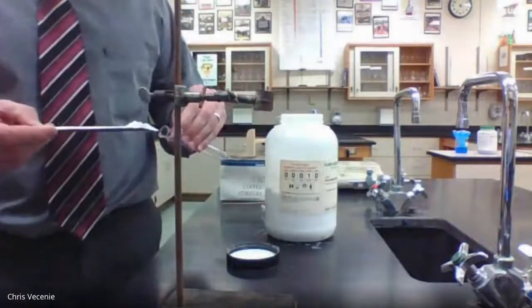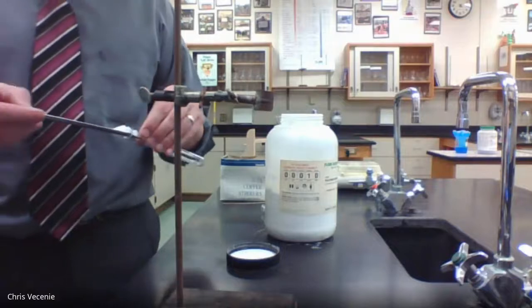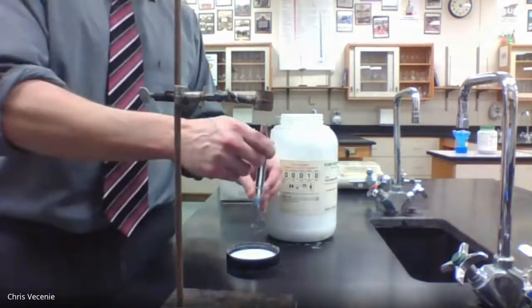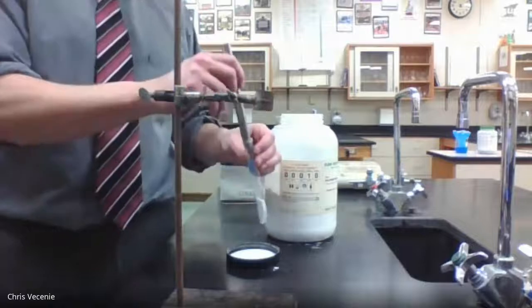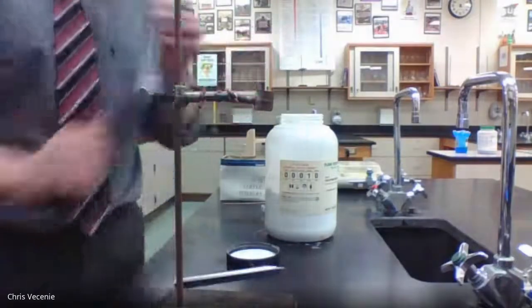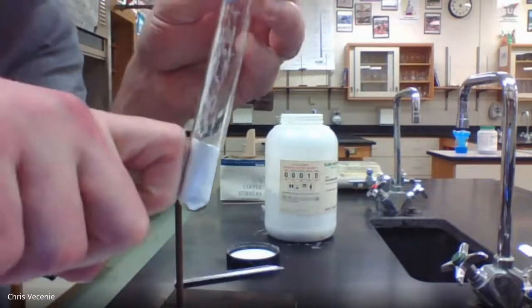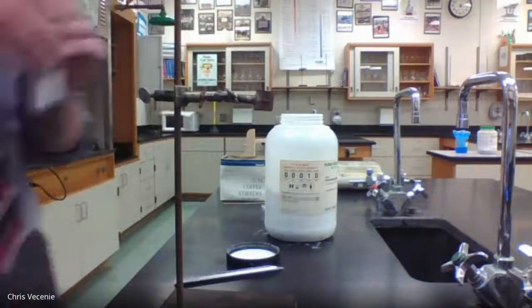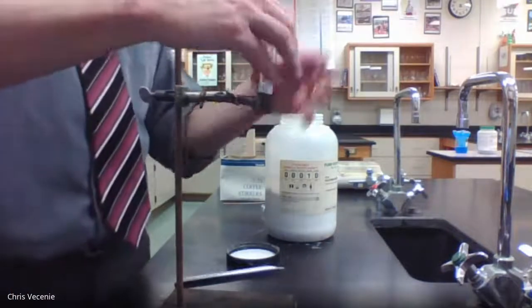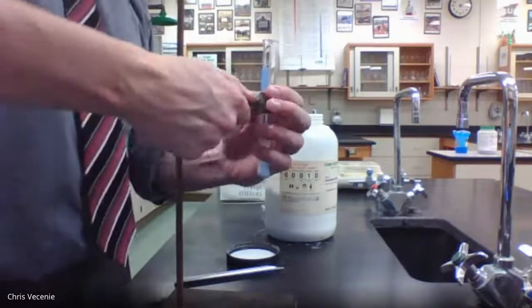I'm going to insert as much of that in there as we can get, trying not to make a mess. You can see I've got some white powder down on the bottom, about a knuckleful. Then I'm going to put that inside this clamp, loosen it up just a bit and tighten it back.